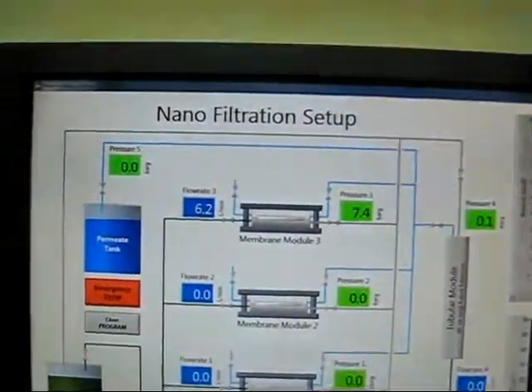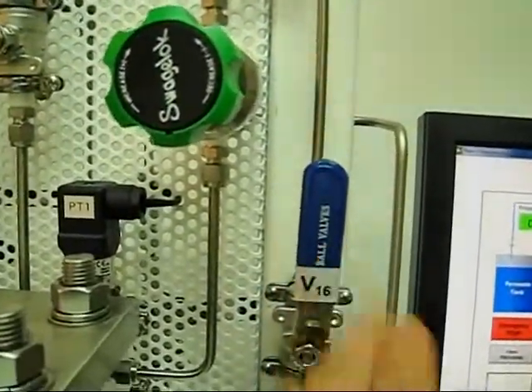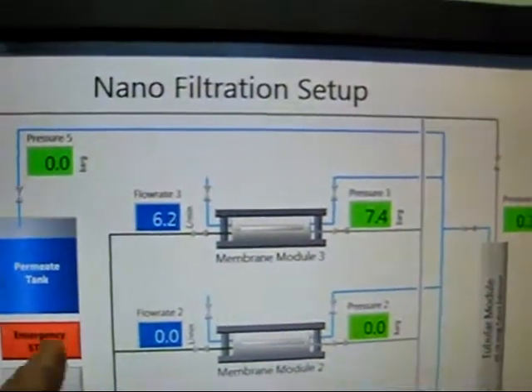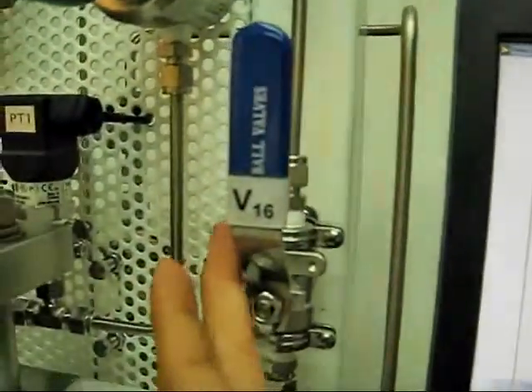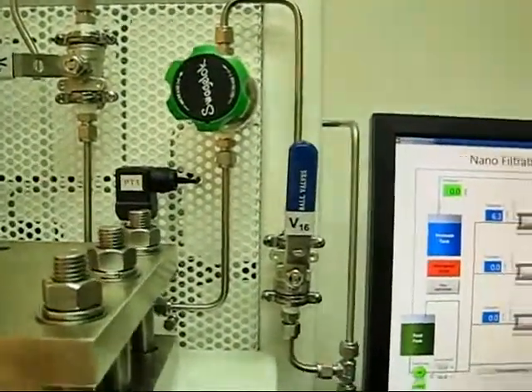I will ask my assistant to help me to slowly close this valve such that the pressure presented here is at 10 bar. You will see the flow at 6.2 will be slowly reduced as we shut off and bring the valve position to a closed position.